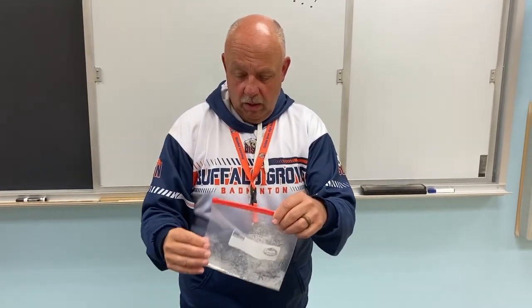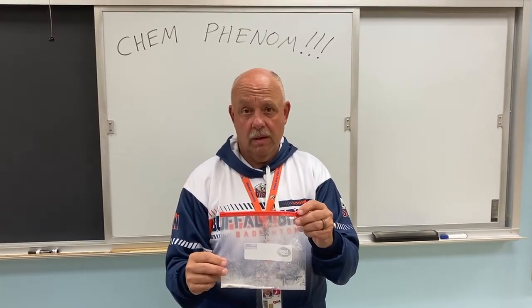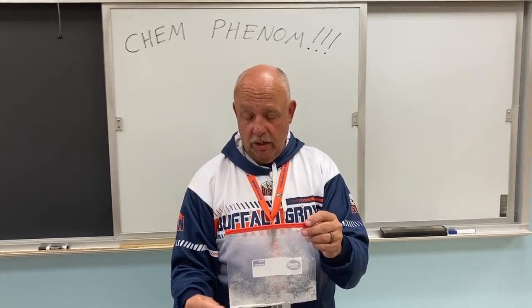Okay. So when we put the two solids together just by themselves, we would say our result would be we didn't really observe anything. And that's still part of science, right? Sure. You can try two things or whatever else. Just because it didn't do anything doesn't mean that you haven't learned something.